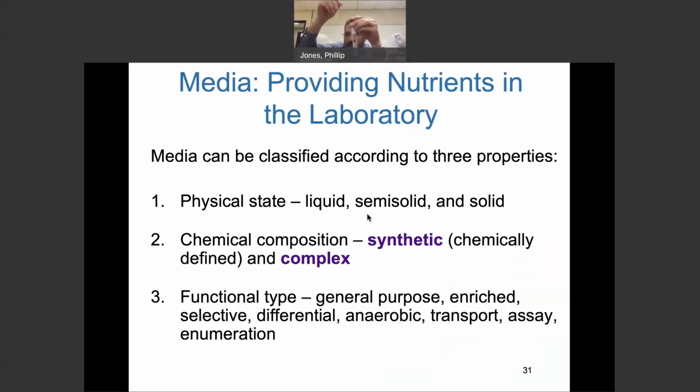So we go in here and we'd stab. This is an inoculation. We go in and we'd stab it straight down, pull it back up. So it'd be a stab line, vertical line. And then we come back, and if there's anything growing perpendicular to it, we know that microbe had flagella and it was able to move. It was reproducing and it was moving away from the Y plane, going into the X plane. Or Z plane there, I guess, depending on.